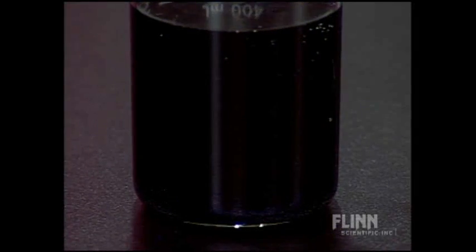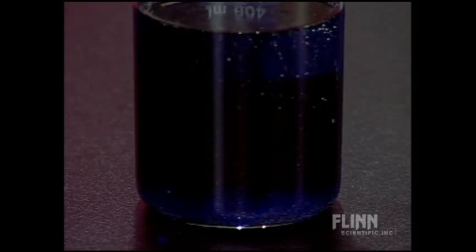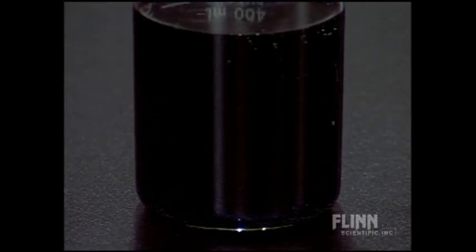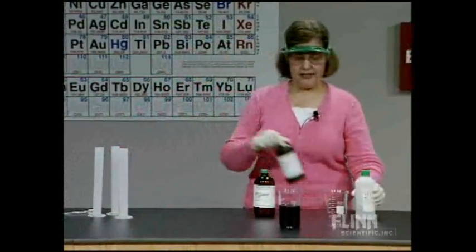And what do we think that is? If we have starch, what do you think gave the blue color with starch? It's iodine, of course. So we have some clues as to what's going on here. You know what I'm going to do, because this is kind of fun. That one's going, you can see it's bubbling a little bit more. So we have some iodine being produced.